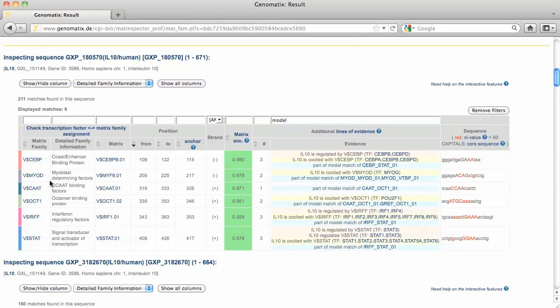The reason for this is that in model descriptions, the similarity threshold for a binding site can be below the optimized matrix similarity. As the MATInspector search was done with default optimized values, it does not report any existing sub-optimal matches.